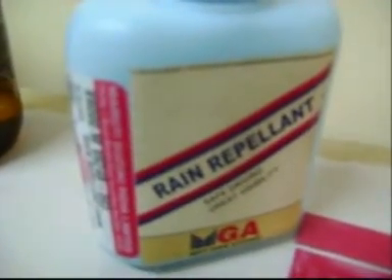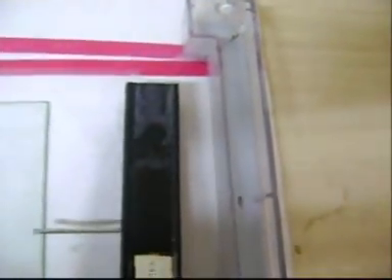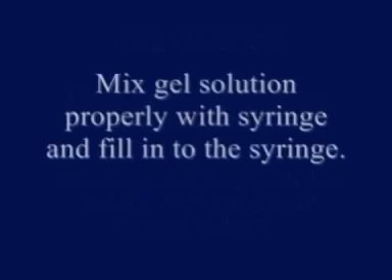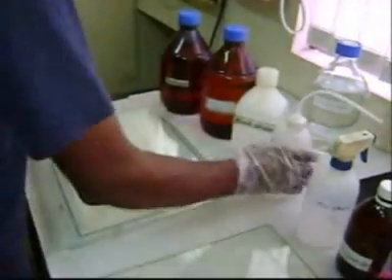This is a plant which is available commercially and helps in the attachment of the gel. These are the spacers and combs. This is the gasket which is attached at the bottom of the glass plates, by which the gel is induced into the glass plates. The gel casting consists of cleaning the plates, addition of T-Med and APS to the gel solution, mixing the gel solution with a syringe, and finally filling the gel solution into the glass plates from the bottom of the set.